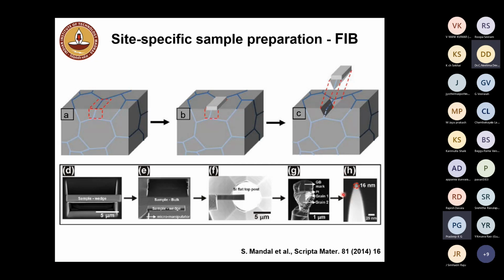Now these kinds of needles go into the atom probe, and the measurement works under certain specific conditions. The measurement doesn't run at room temperature. So there is a range. You want to image individual atoms, meaning you do not want atoms to vibrate randomly. You want to freeze the atoms on the surface of the needle so that the X and Y position of the atom can be mapped on the detector as long as it remains frozen.